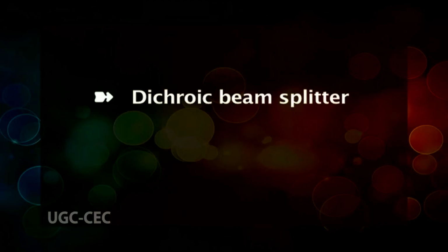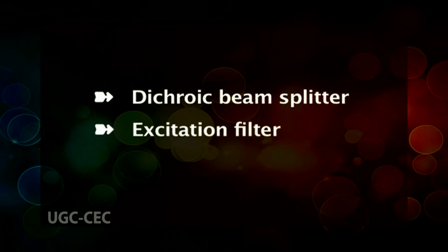At the heart of the fluorescence microscope is the dichroic mirror cube, which comprises three components: a dichroic beam splitter, an excitation filter, and a barrier filter. Specific filters are used to isolate the excitation and emission wavelengths for each fluorochrome.